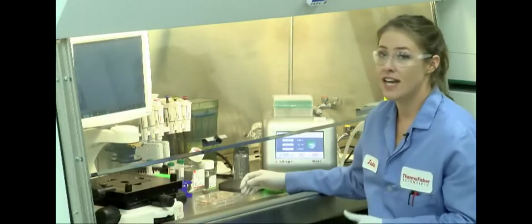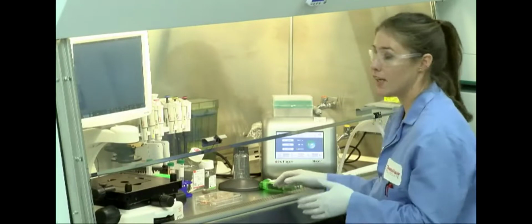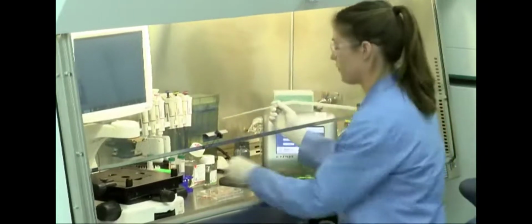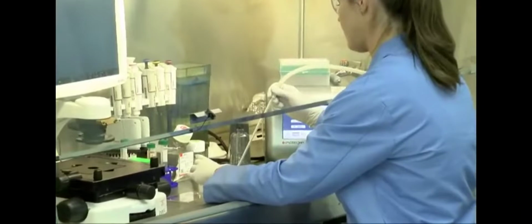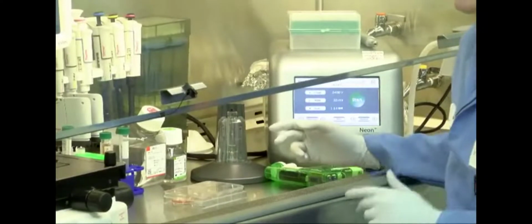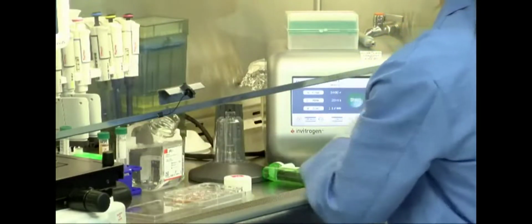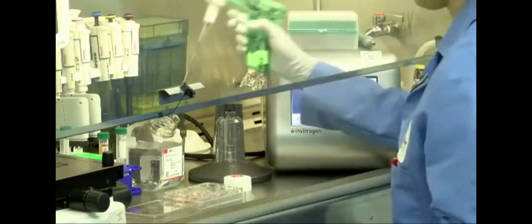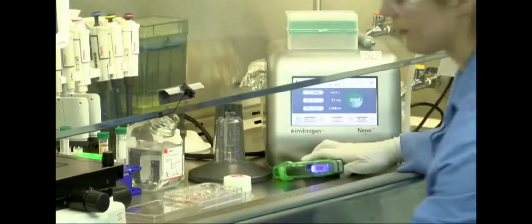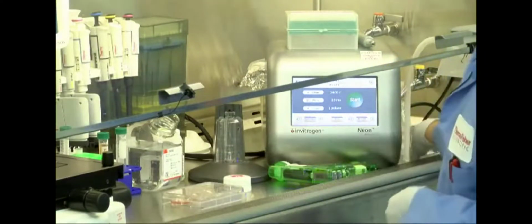To prepare your cells, the first step is to dissociate your cells from the culture dish. To do this, you want to first aspirate the media from the cells. Next, you want to rinse your cells with PBS without calcium or magnesium. You can rock your plate back and forth a little bit to make sure that all the cells are rinsed, and then you can aspirate the PBS.